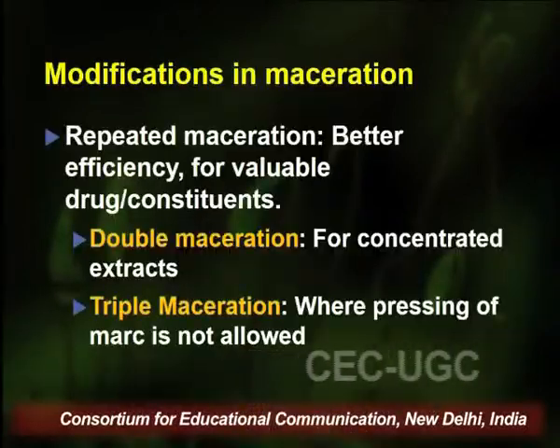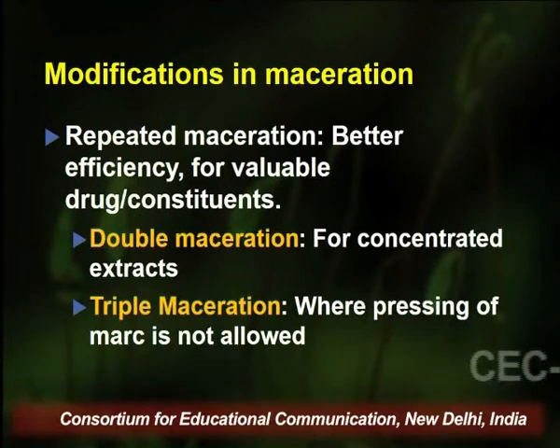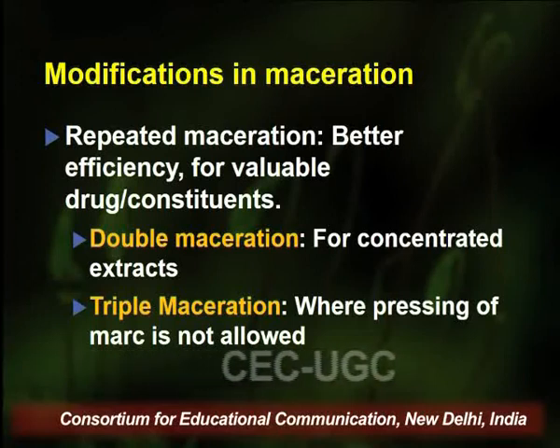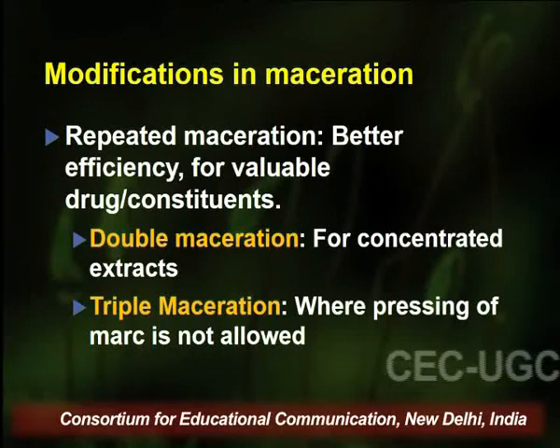Now we move on to the modifications of the maceration process. As we have discussed, maceration is simply soaking the drug material in the solvent for a specified period of time, which is normally 7 days or minimum 3 days, with intermittent shaking or agitation which we provide to the mixture.